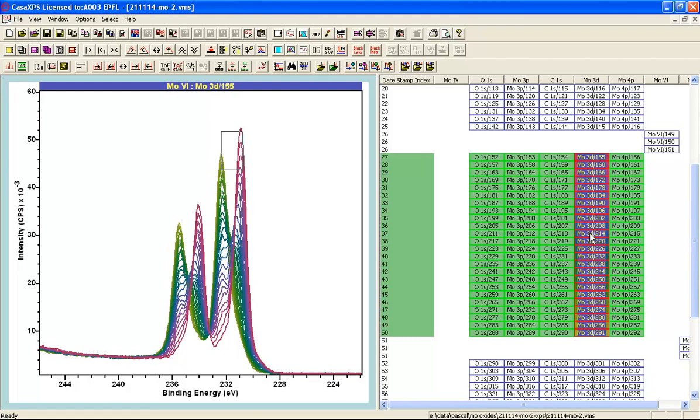However, over time and with each measurement, something has changed in the sample, which means that molybdenum trioxide as a semiconductor needs charge compensation, and the fact that the peak is offset towards the lower binding energy side tells us that electrons were accumulating on the surface and a steady state to some extent was achieved, and therefore you end up with a peak for the 5/2 component that is somewhere at an energy that is too low in binding energy for what we would expect for molybdenum trioxide. However, with time, the peak moves and ends up at an energy which is in fact more consistent with what we would expect for molybdenum trioxide, that we're looking at a binding energy for the 5/2 peak after the sequence of measurements that is closer to what you would expect for a conducting form of molybdenum or a neutral form of molybdenum trioxide.